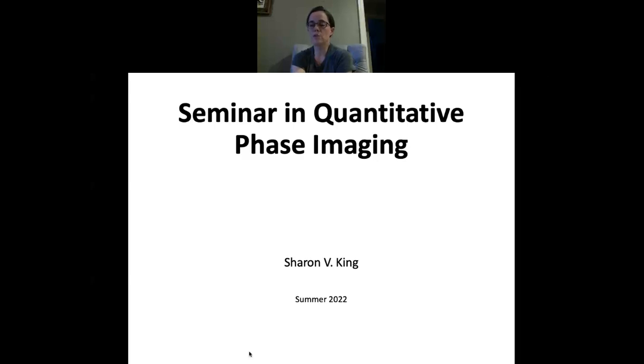So the great advantage of transmitted light methods is that they require so little illumination. Intensity levels needed to capture high contrast images are so low that they can be used to image live samples in a microscope environment with very low levels of phototoxicity and without potential functional interference from fluorescent labeling complexes. So from this perspective, transmitted light microscopy is ideal for studying the dynamics of biological systems. So you can imagine imaging for hours or maybe days, or as long as you can keep your model system going, whatever model system that might be.